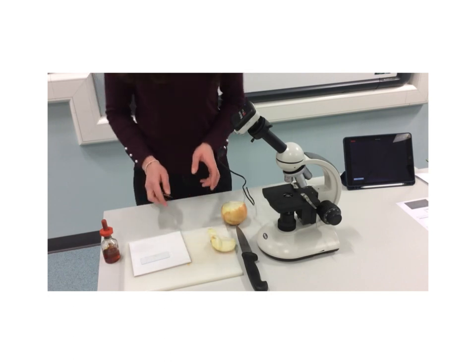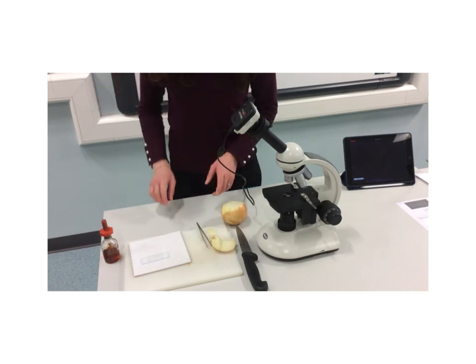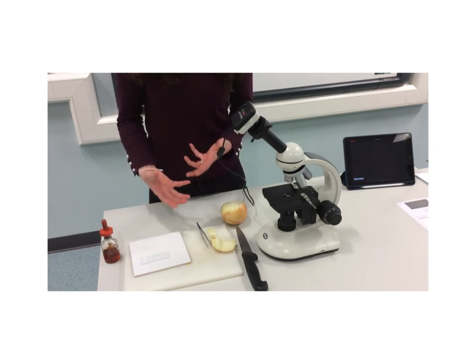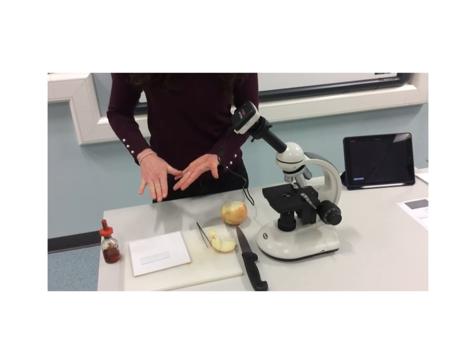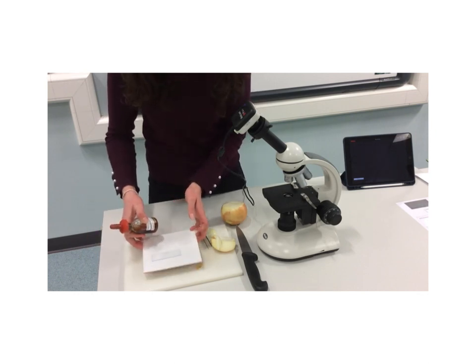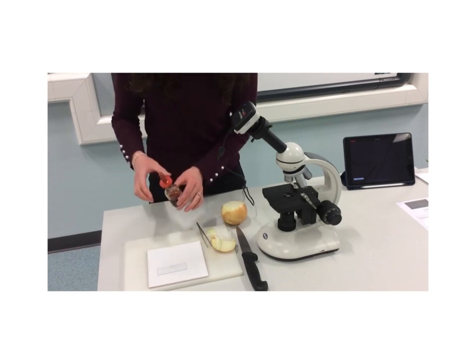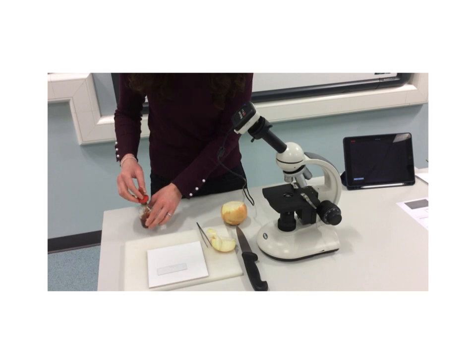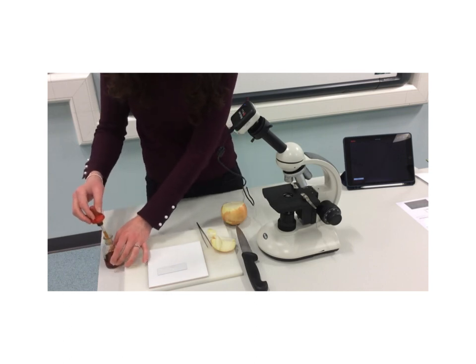Now I don't want to just put that straight on my slide. Two reasons. One, I actually won't see anything because our onion skin and our cells will be transparent. So what we need first of all is a stain in this case, because our onion cells are transparent and they don't have a colour, so I actually wouldn't see anything if I put this under the microscope now.